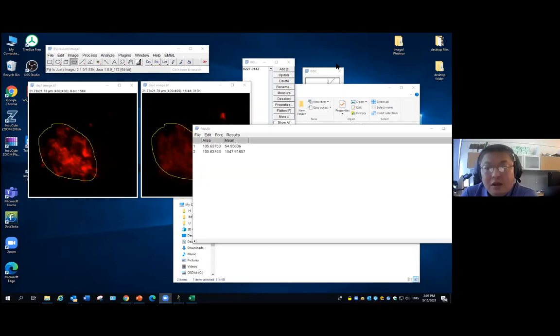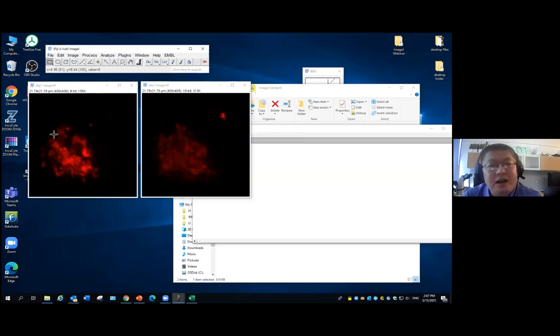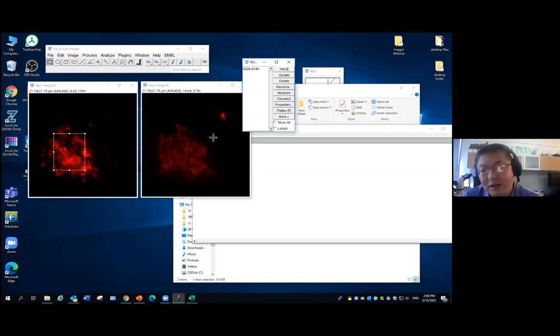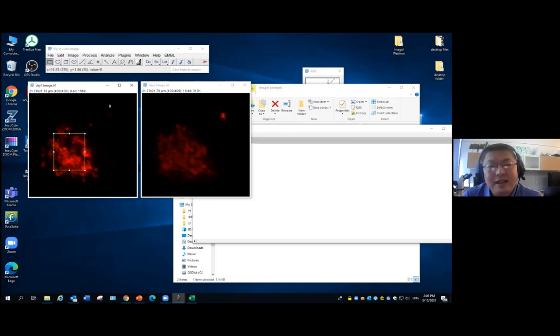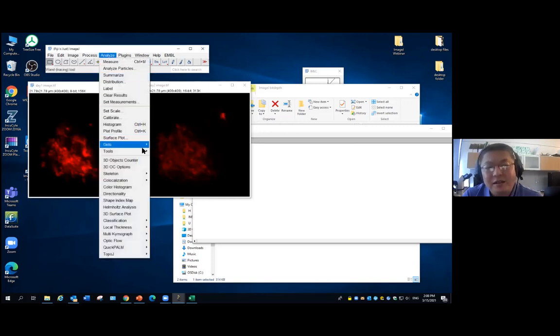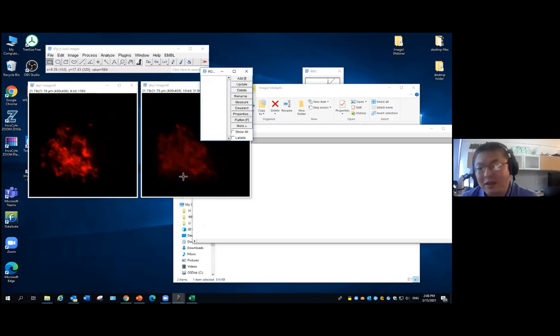Open the ROI Manager, let's see. Whenever you draw an ROI, you can just press T on your keyboard, and it will add the current one to the manager. That's how most people open this, but the standard way to open it is in Analyze, Tools, ROI Manager.